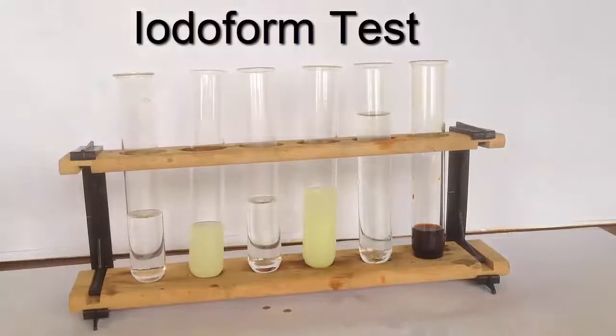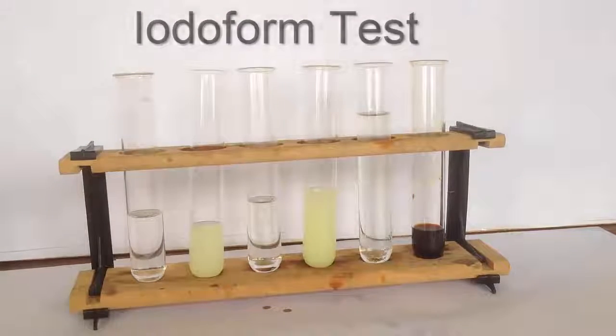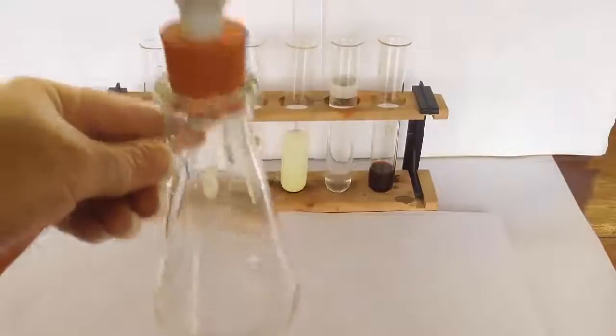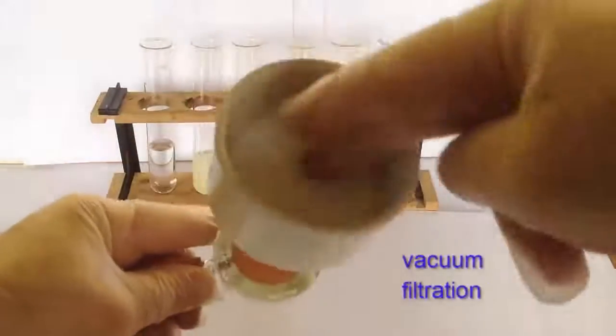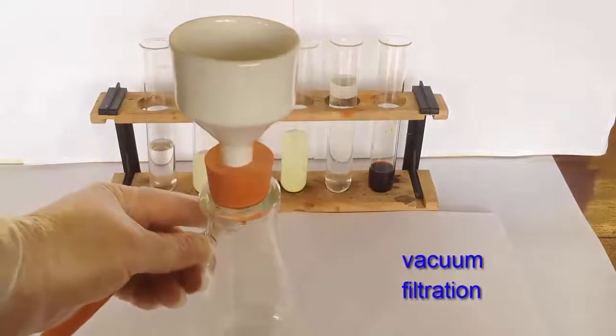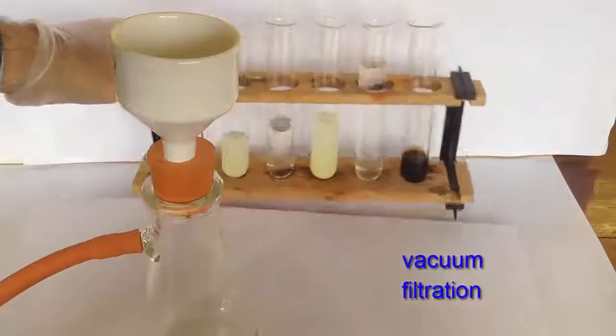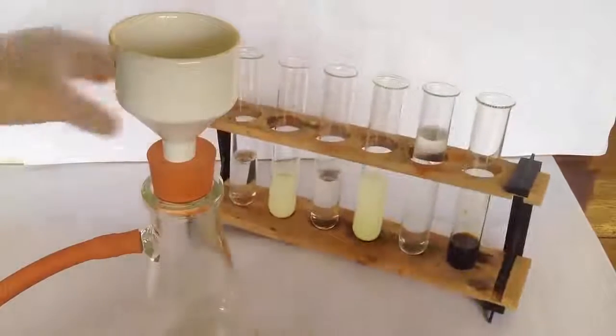Let's take a look then finally at the precipitate. So here's a Buchner funnel and Buchner flask attached to a siphon pump which draws the air out of the flask. This is referred to as vacuum filtration or filtering under reduced pressure.